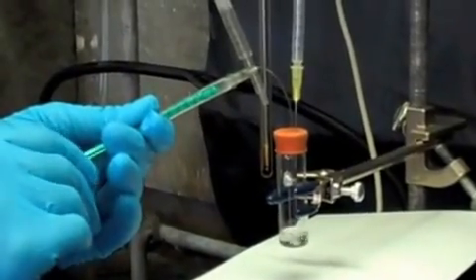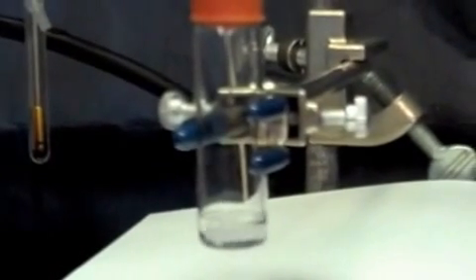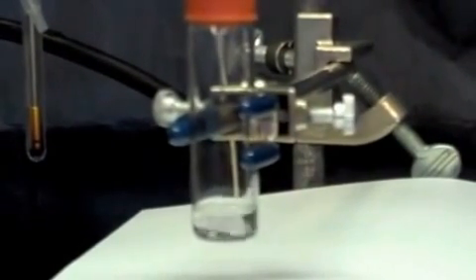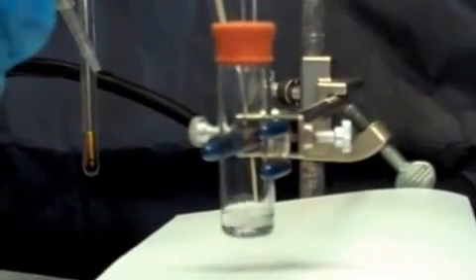Can you see the vapors? Note the vapors coming up on the sides of the flask. The reaction is exothermic and the THF is boiling a little bit. I'm going to slow my titration to avoid this.